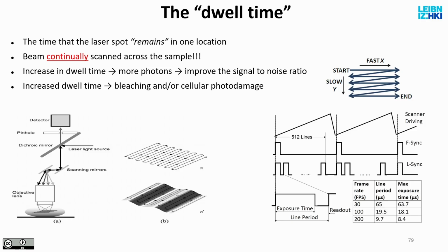But from the same signal, I can say, collect this for 500 nanometers. Now I increase my pixel size by a factor of 5 from the same signal by integrating this analog current, or voltage if you wish, for that much longer. The signal is continuous, so I have full freedom to determine how large a pixel is.